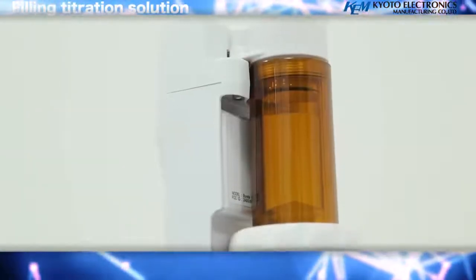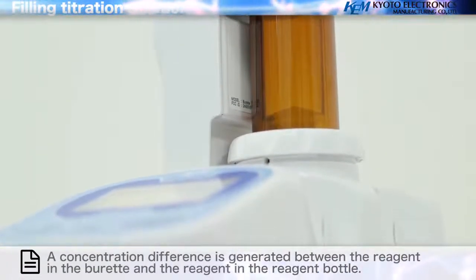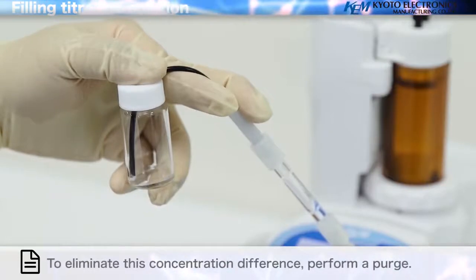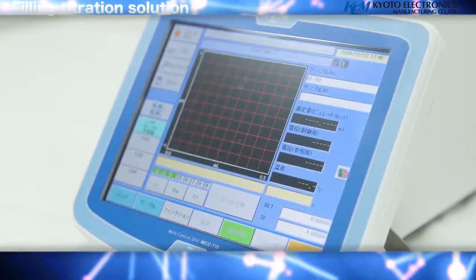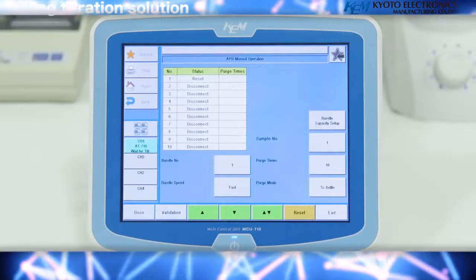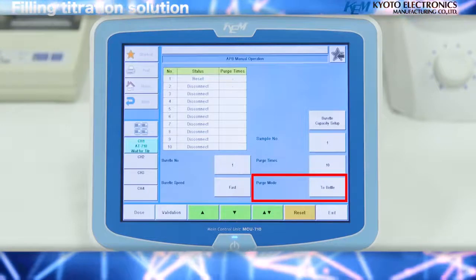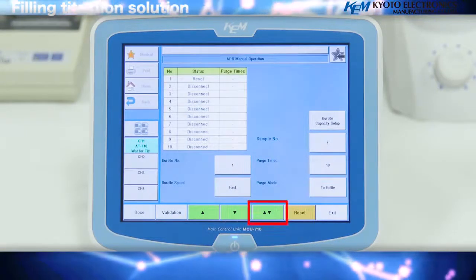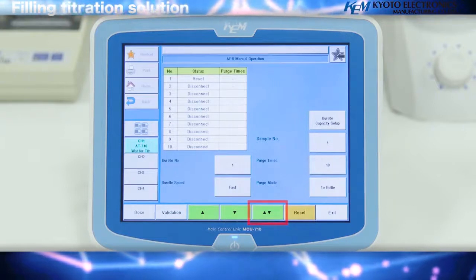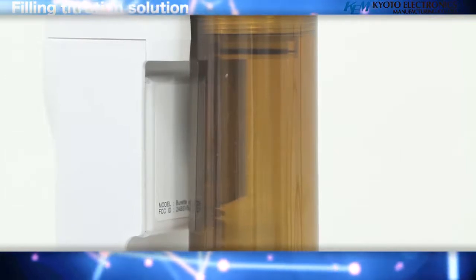Filling titration solution: a concentration difference is generated between the reagent in the burette and the reagent in the reagent bottle. To eliminate this concentration difference, perform a purge. Select the burette on the screen, select purge mode, select To Bottle. Set the number of times to purge to 10, and press the up and down arrow keys to activate the piston 10 times to fill the burette while expelling excess air.